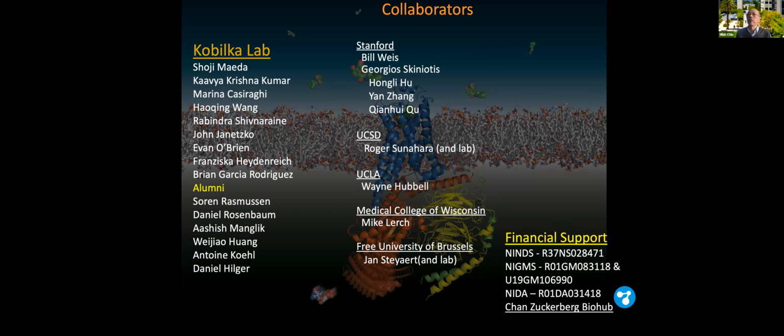Okay, I have a question for you, Bryan. Since there are so many proteins in this superfamily of G protein-coupled receptors, in the case of a pharmaceutical company, how many possible drugs are they working with? Do you think there's a prospect of solving a structure a day, so that they can do a big screening in the whole drug discovery pipeline? I don't think it's well, you know how much microscope time is needed.